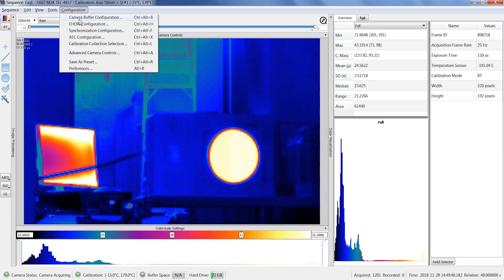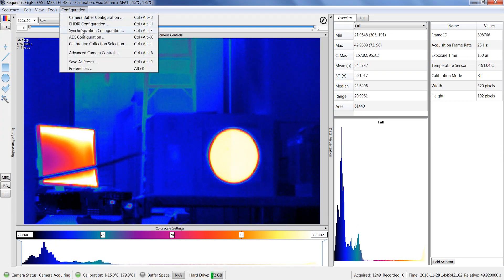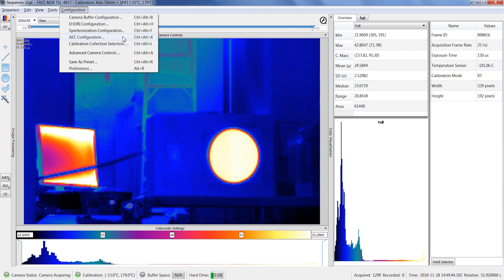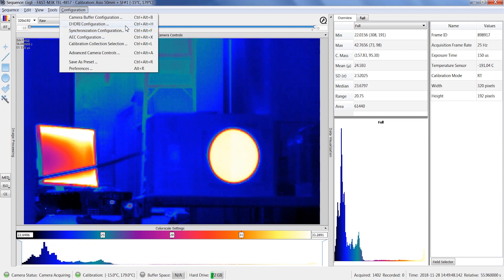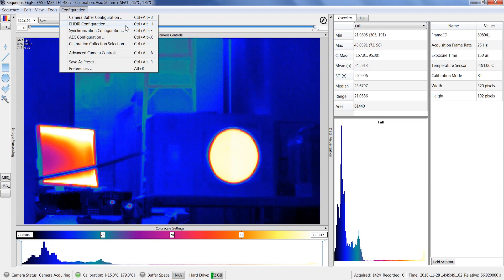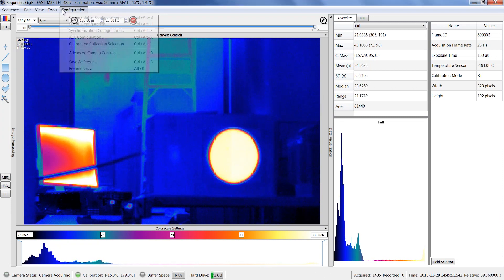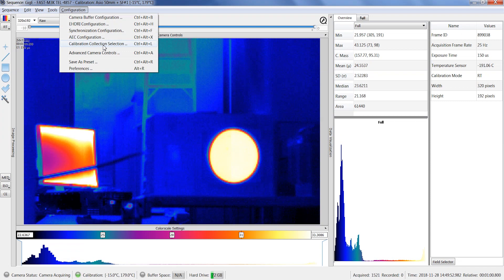In the configuration list of the sequence window, you will be able to configure the internal memory and the frame synchronization. The AEC mode and the enhanced high dynamic range imaging mode can be set from the configuration list as well.